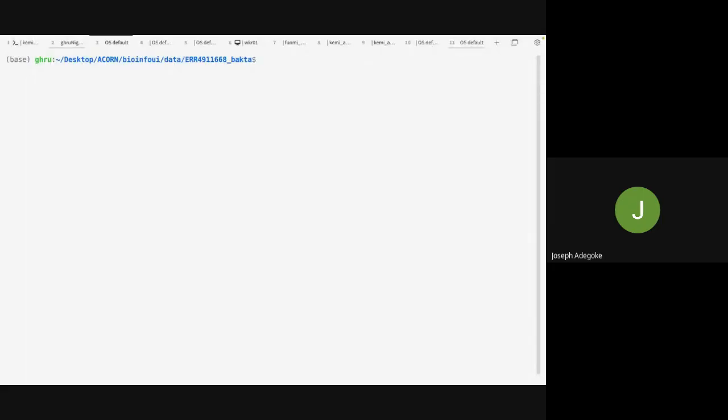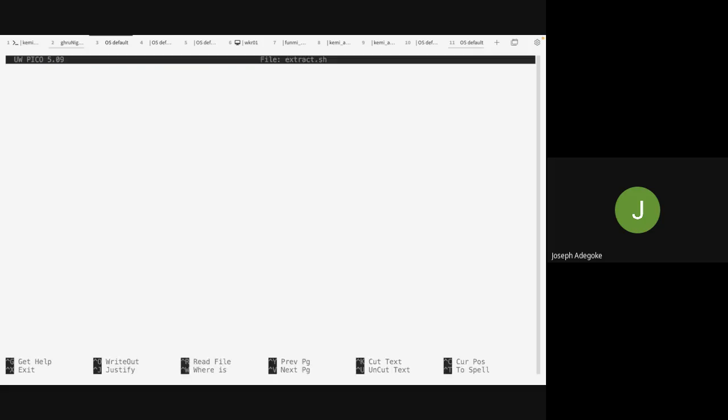So let's use nano to write our script. Let me name it extract.sh. So we open our editor.